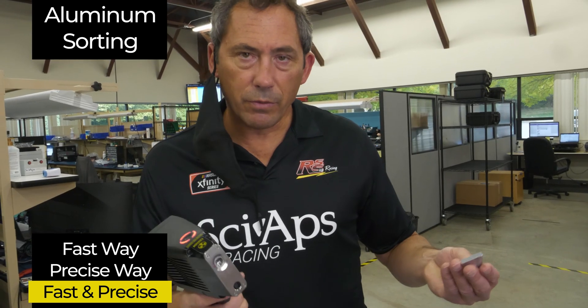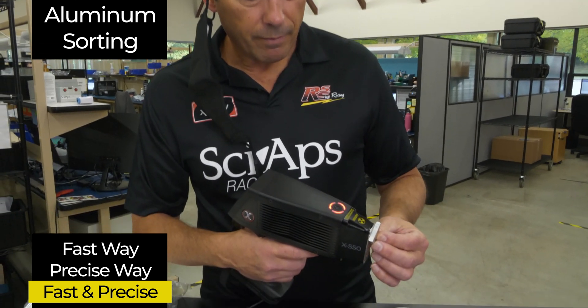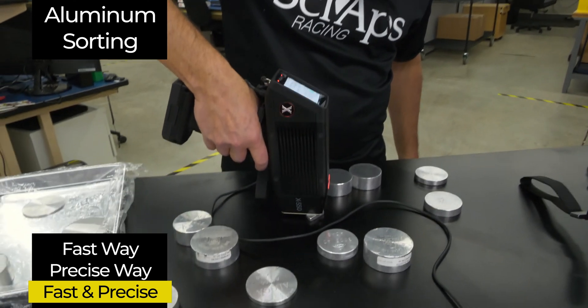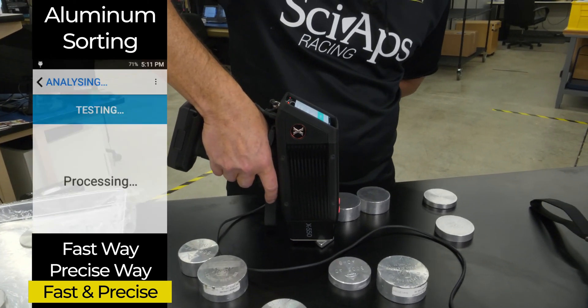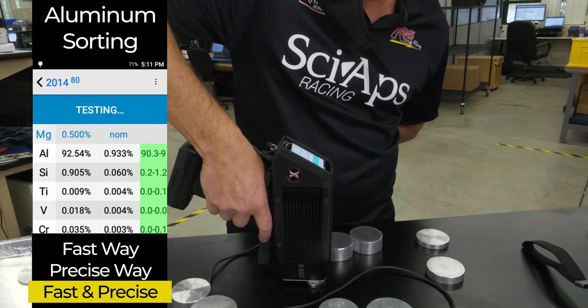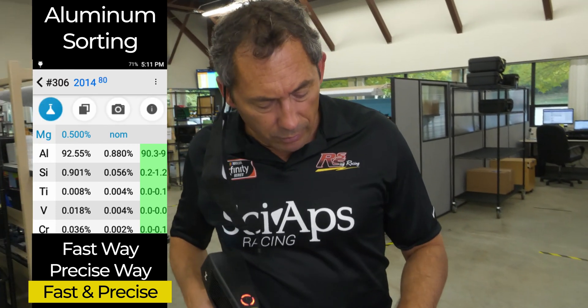Let's go to a 2000 series. Most of the time you're going to get 2024. But if you do see another kind of 2000 series alloy, you'll want to know about it. This is a very fast way to check if it's a 2014, where you have really low magnesium. So that's good for the 2000s.